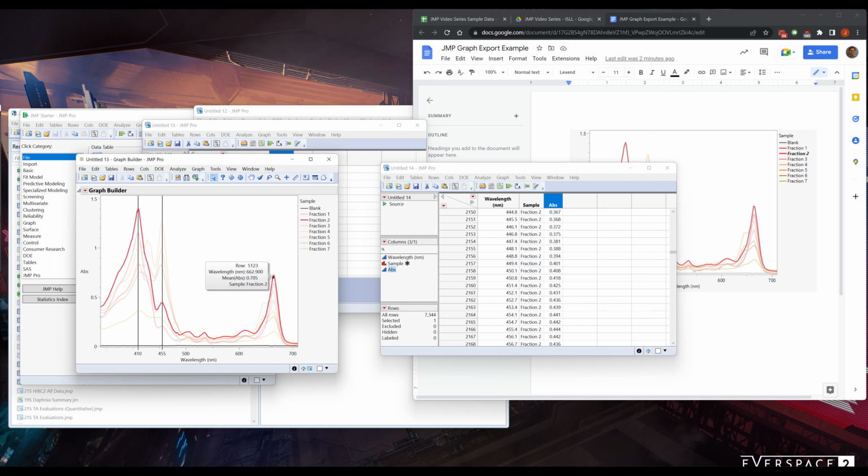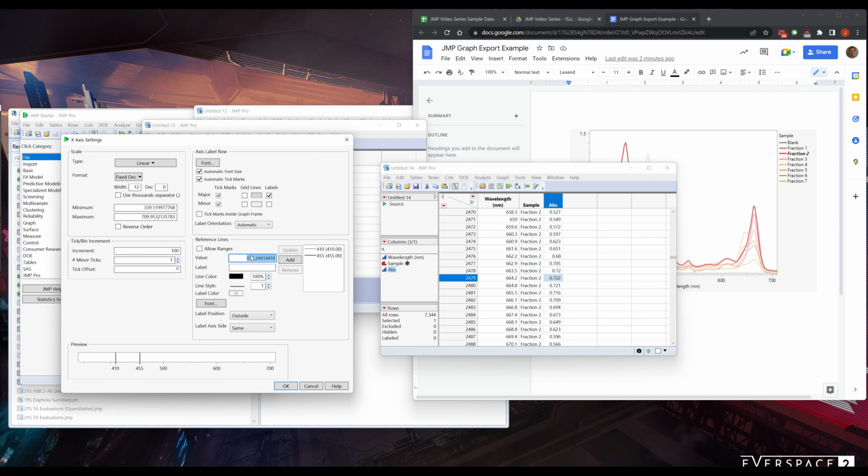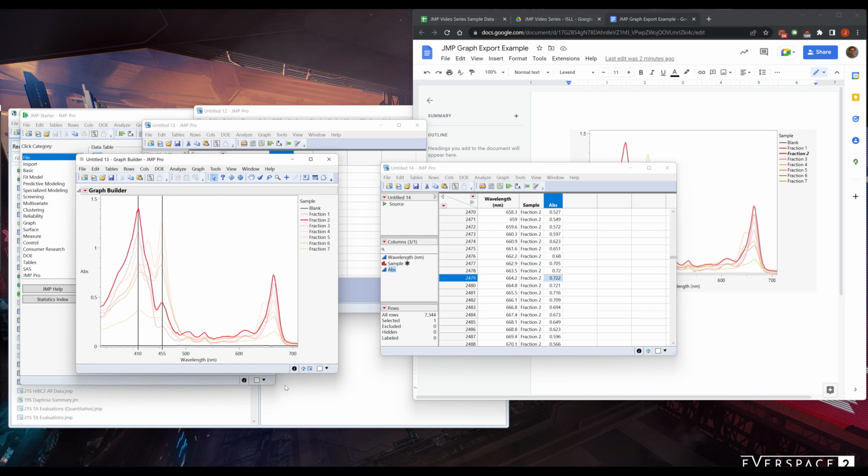And then lastly, we should have one right at 660. Oh, 64. Okay. There we go.